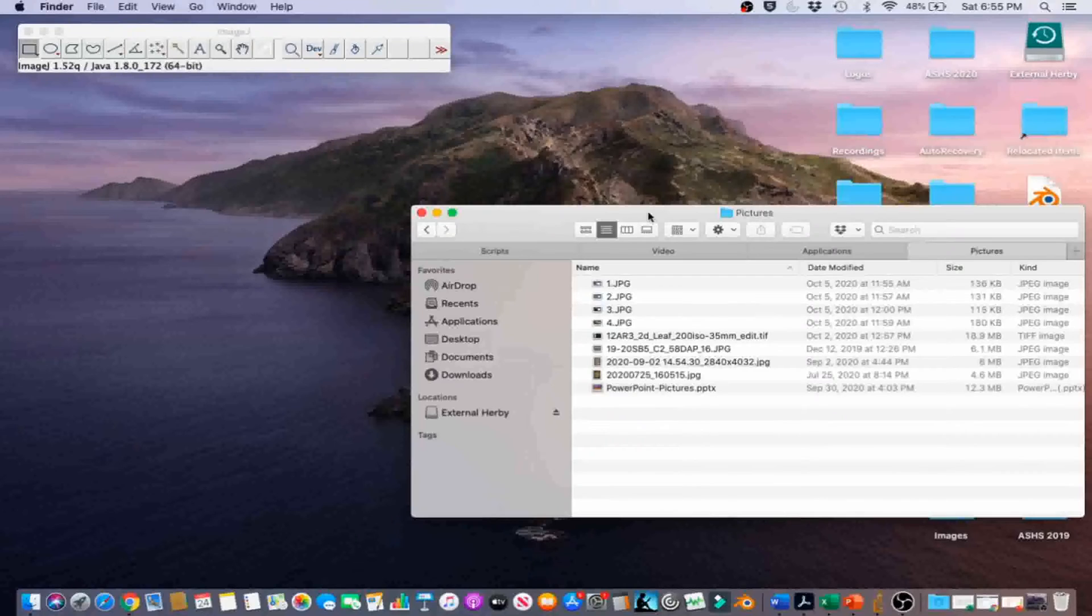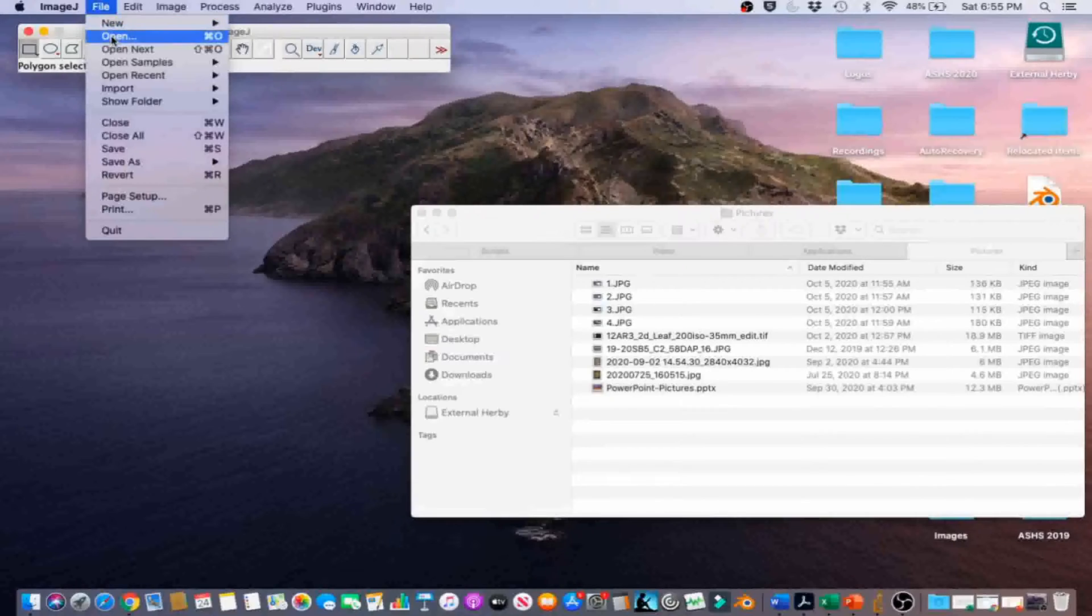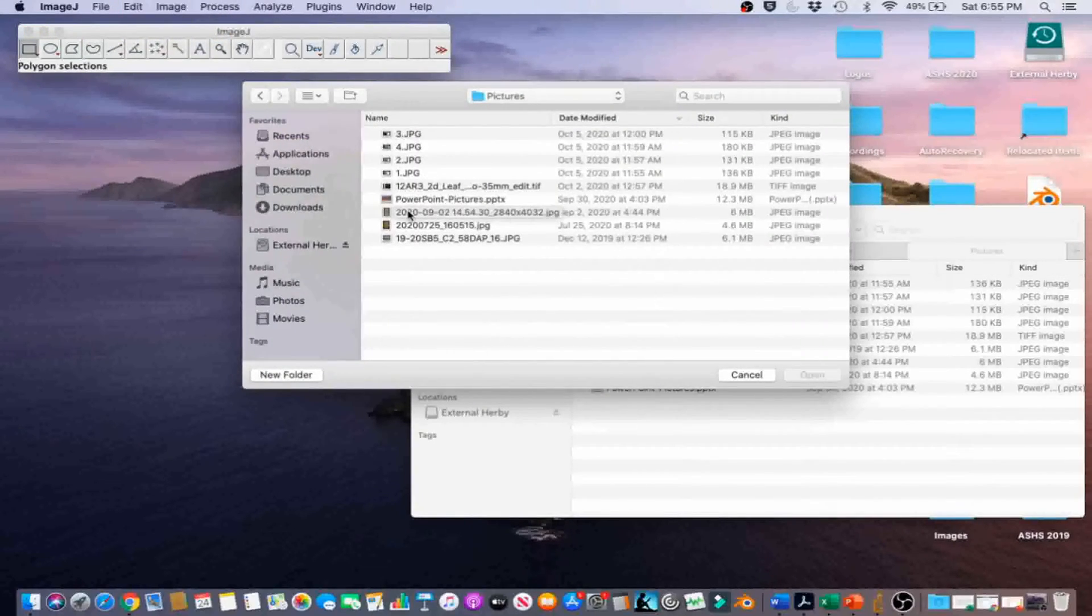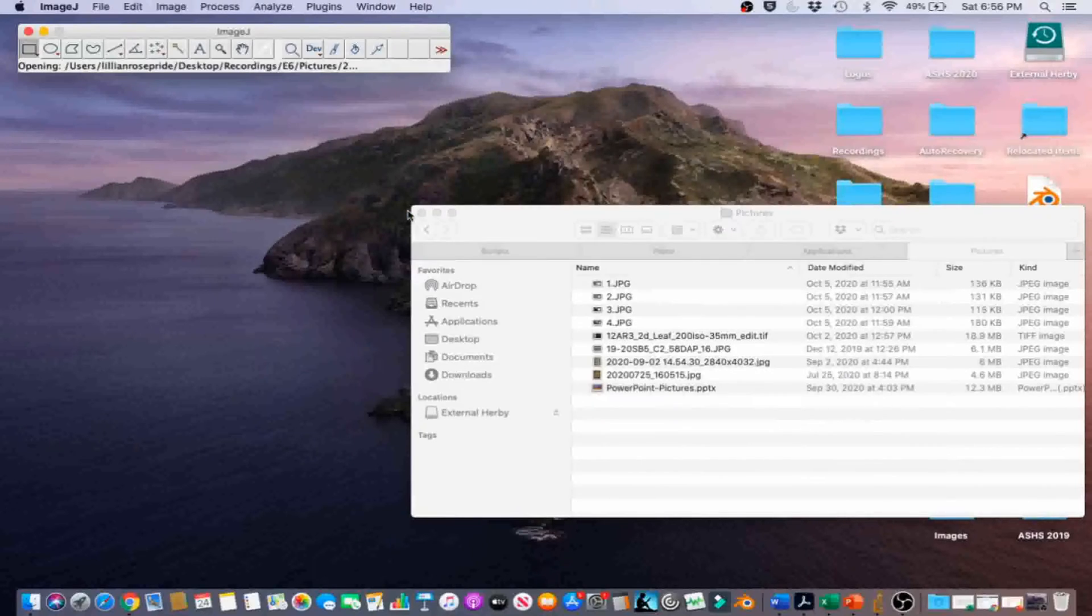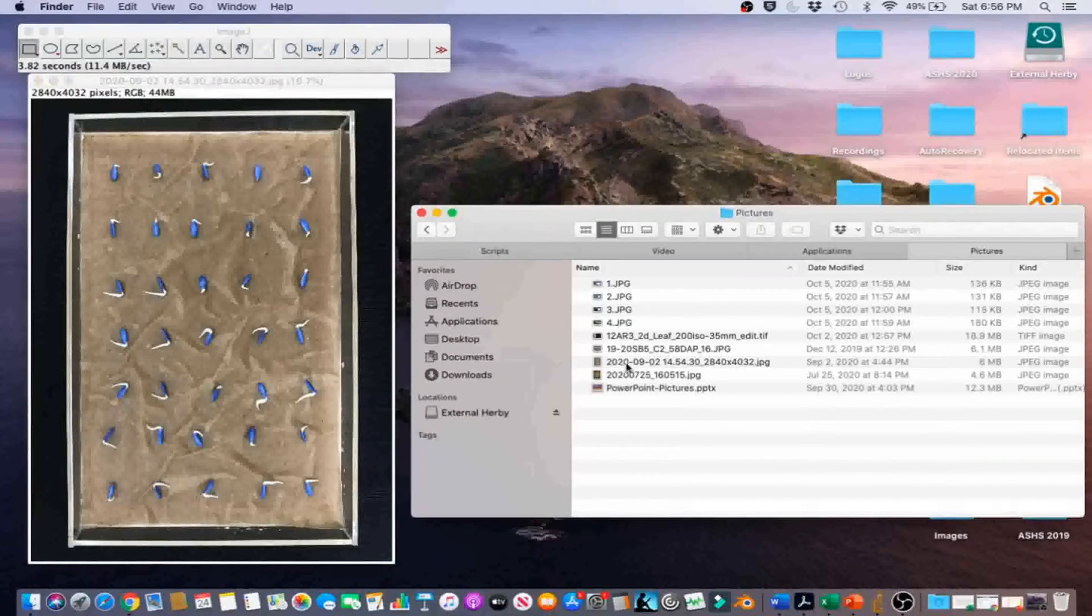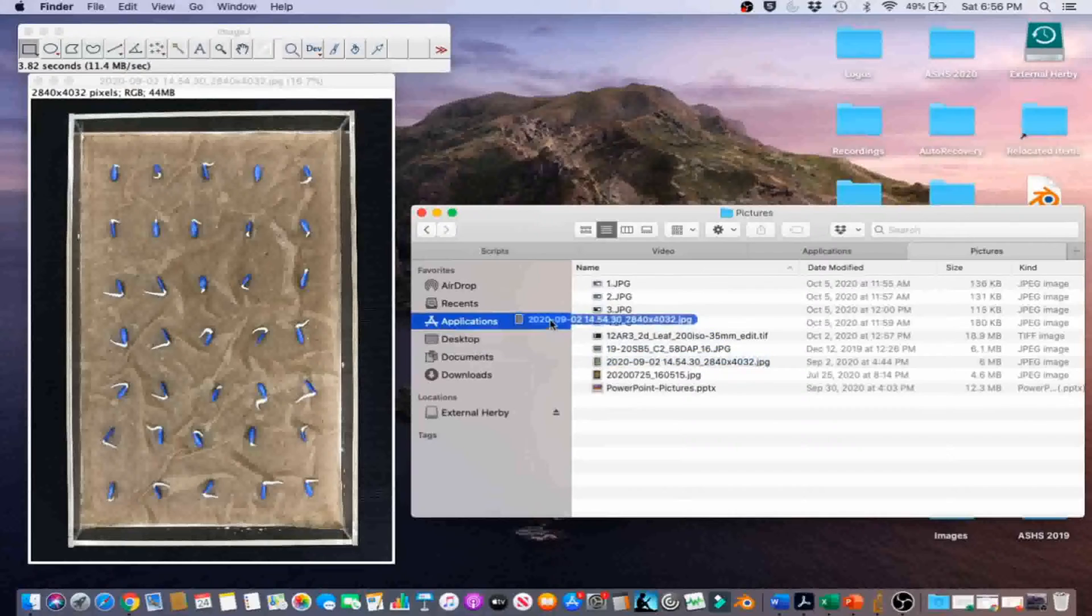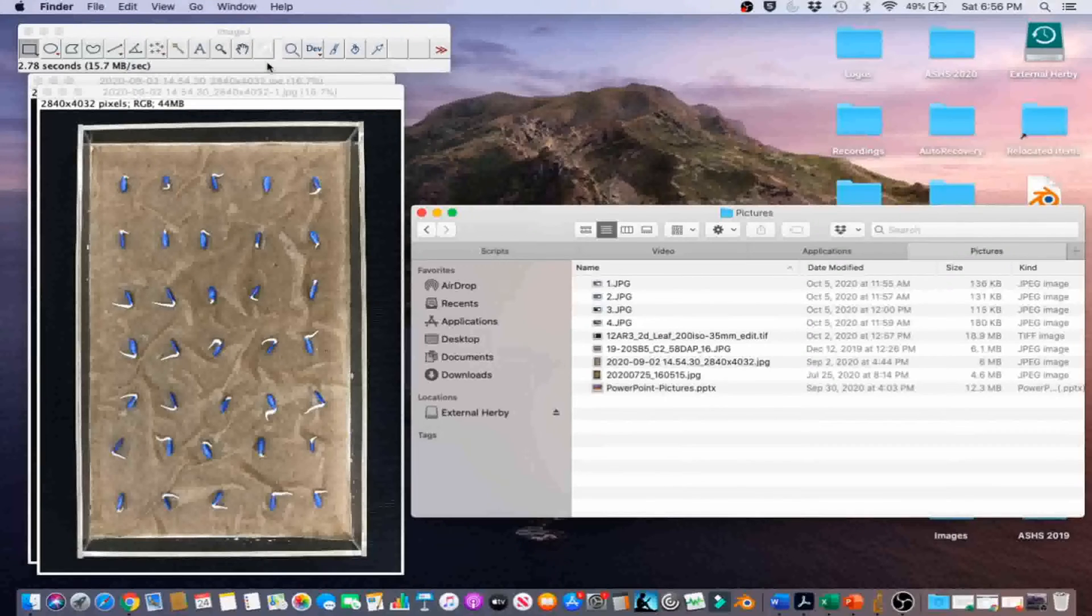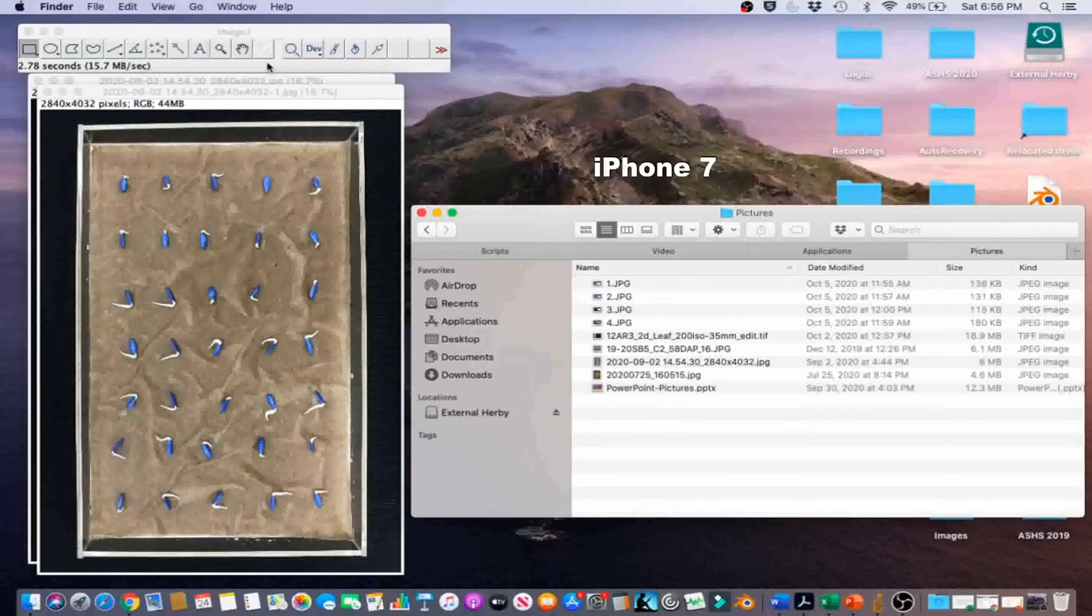Let's import the image for this example. Go to File, Open, and navigate to the image. You can also drag and drop the image onto the ImageJ toolbar. This is a photograph of cucumber seeds sewn in an acrylic tray. The photograph was taken using an iPhone 7 smartphone.